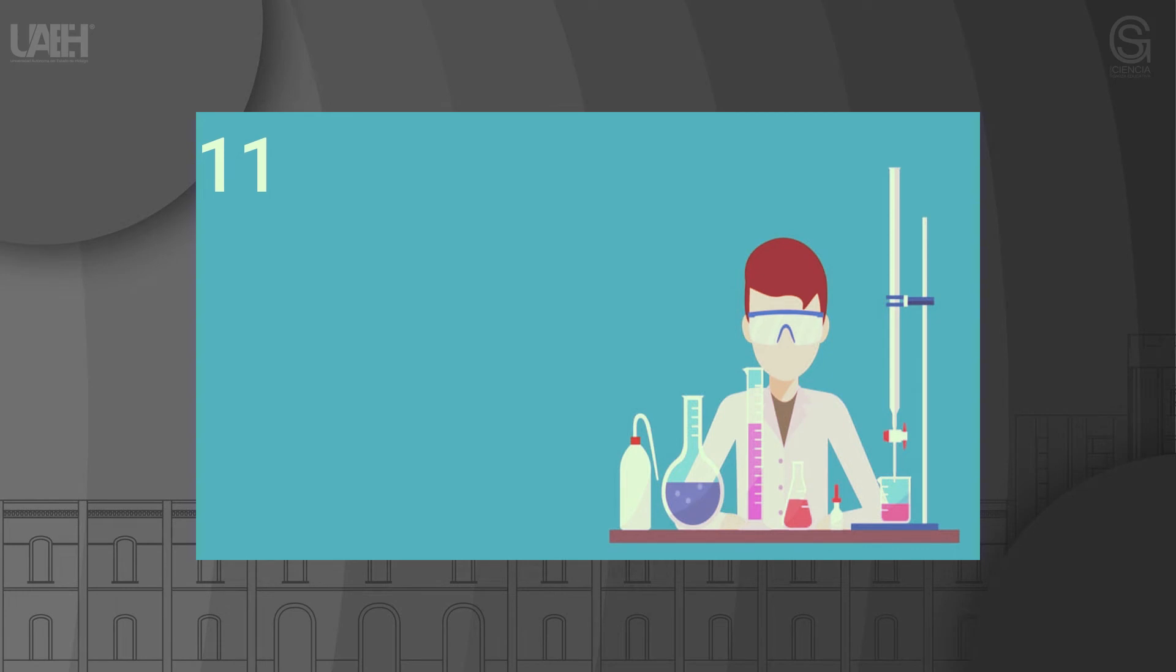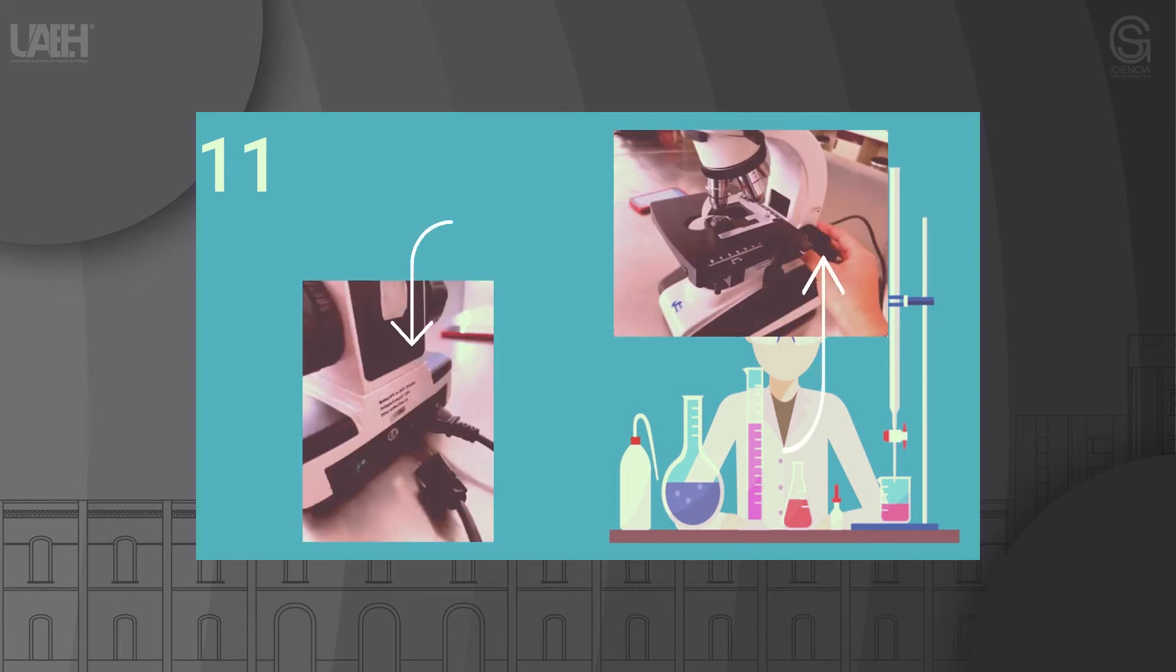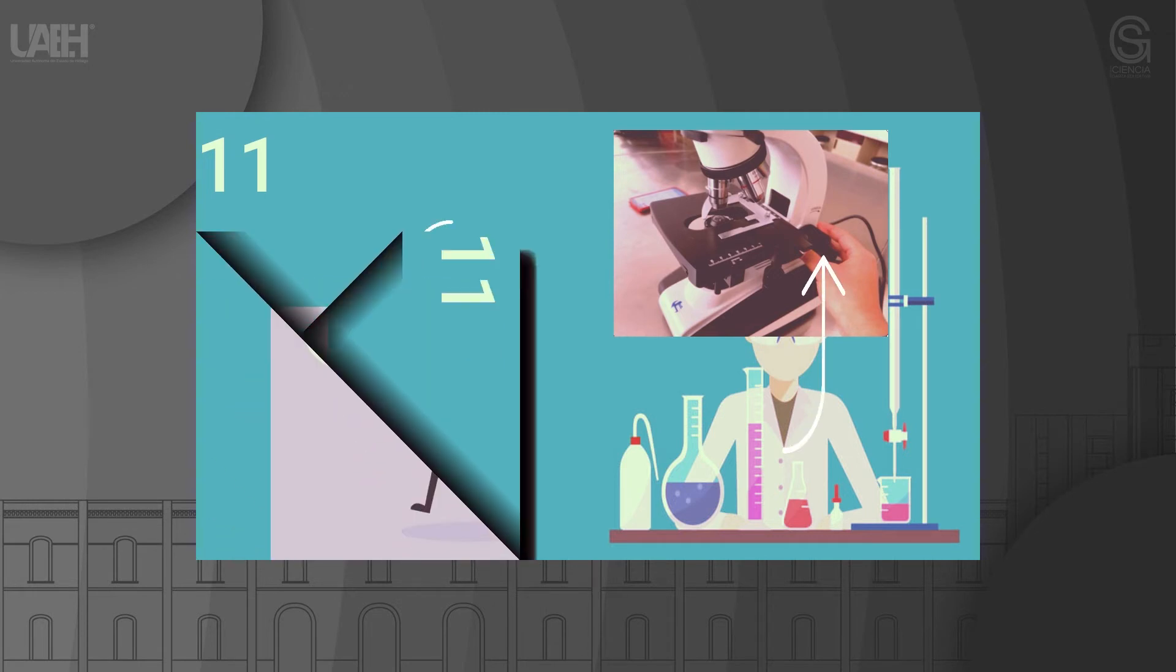Step 11: When the observation is finished, turn off the light and adjust the coarse screw to maximize the distance between the sample and the objective. Then remove the sample and leave the minimum magnification objective selected. If you have finished using the microscope, you can cover it with the cover to prevent dust accumulation.